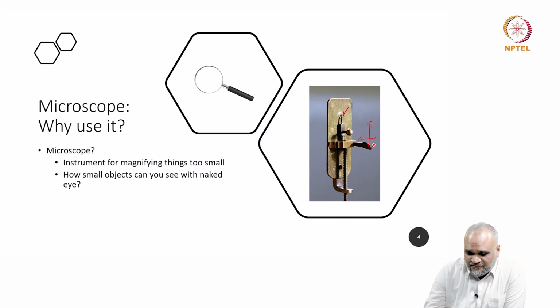But if you look at the very first version of the microscope, you have a small lens and a sample goes at this particular location here, and you cannot move the sample in 3 dimensions, there are only 2 dimensions where the movement of the stage is. So what you have here is the fixed working distance, and you bring an object very close to the lens and you start seeing features which are not visible to the naked eye.